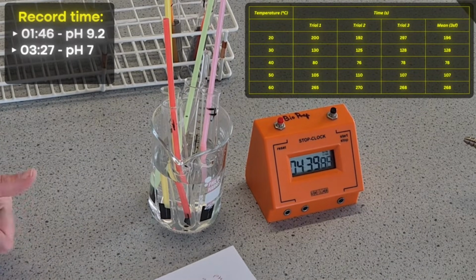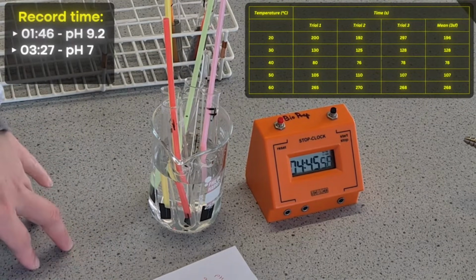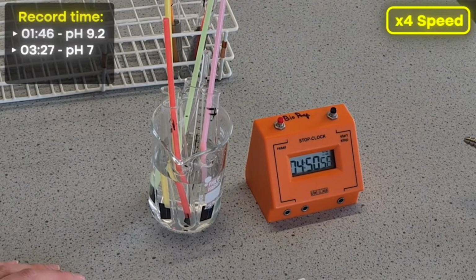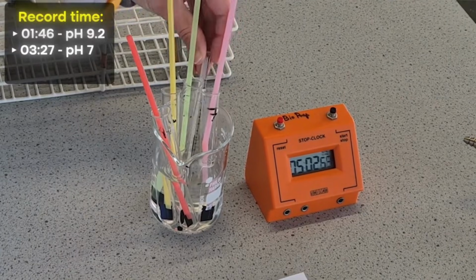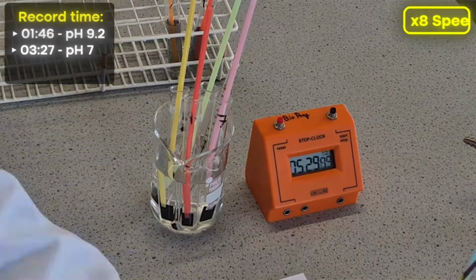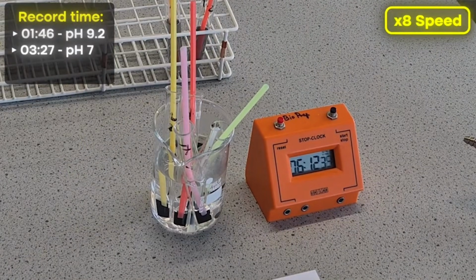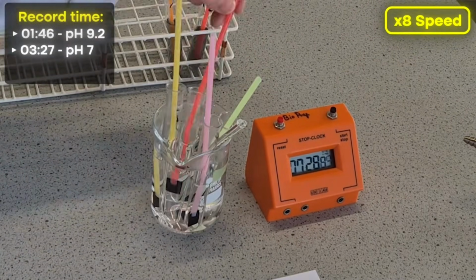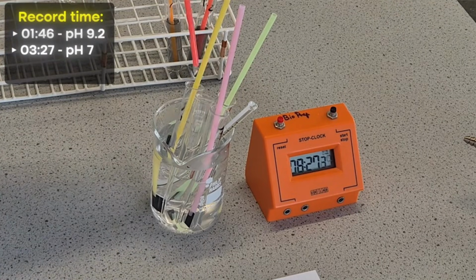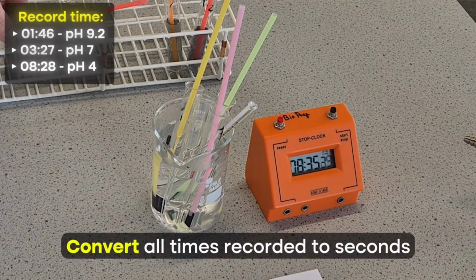If you do have time as well, they could do 2 extra repeats. You've got 3 trials because then they can identify anomalies to exclude from the mean. And again, just check your temperature throughout. Okay, and then last one, 8.28, and again, we'd then need to convert that.